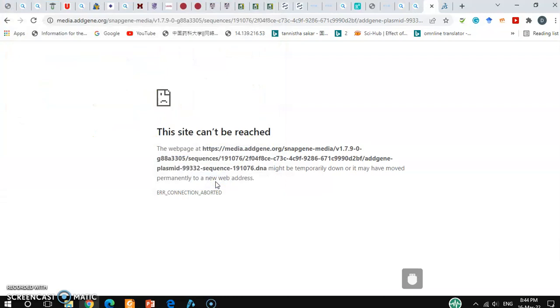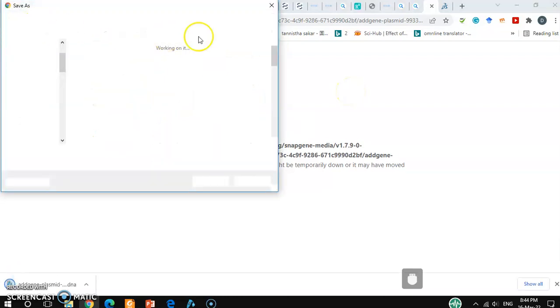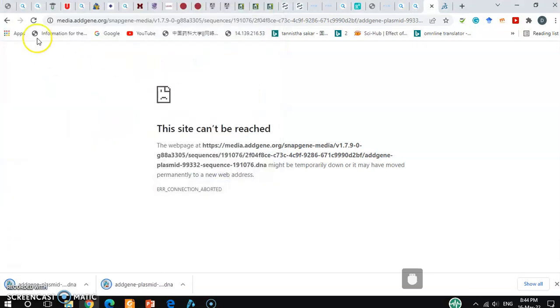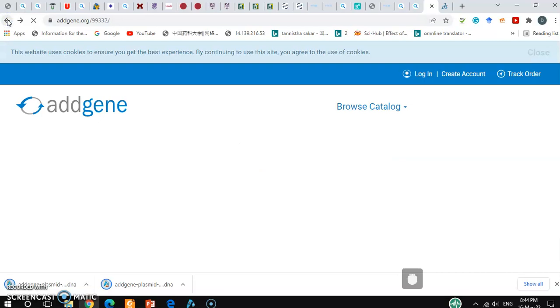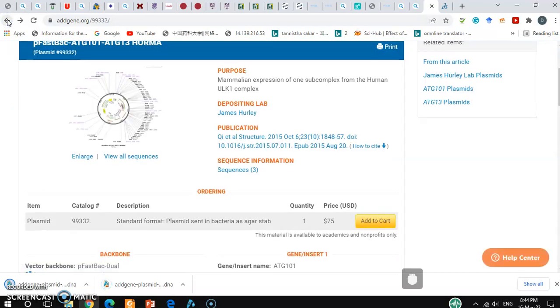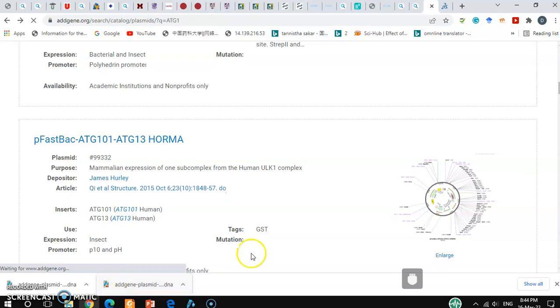Save it. Let it download. It's already downloaded. So let's open it.